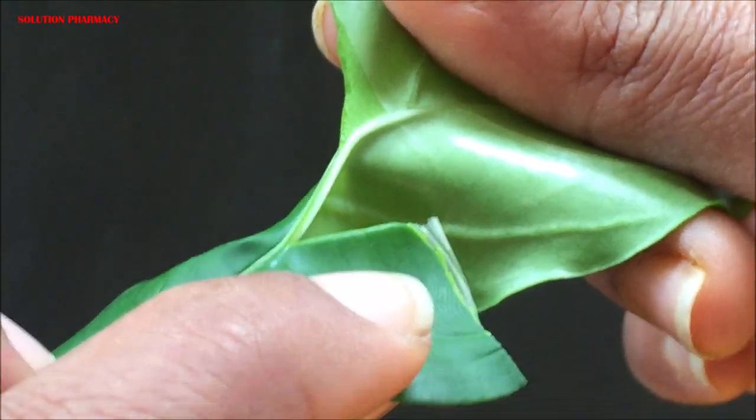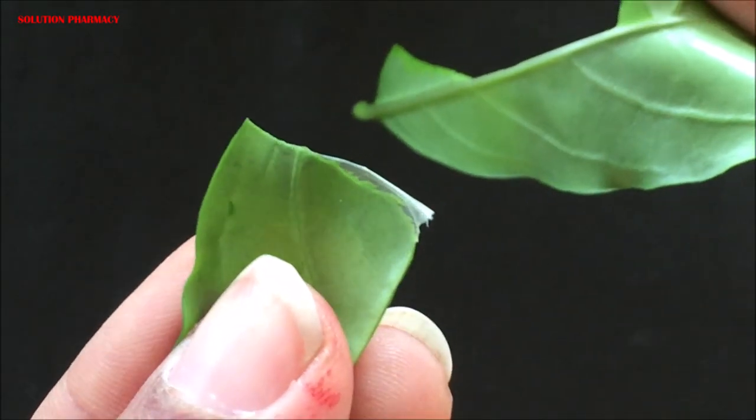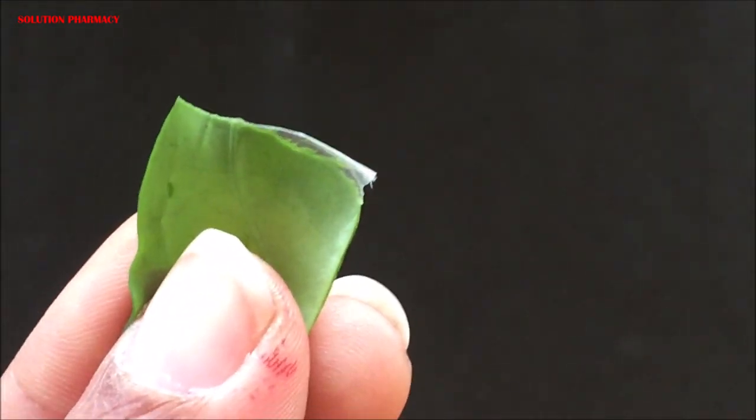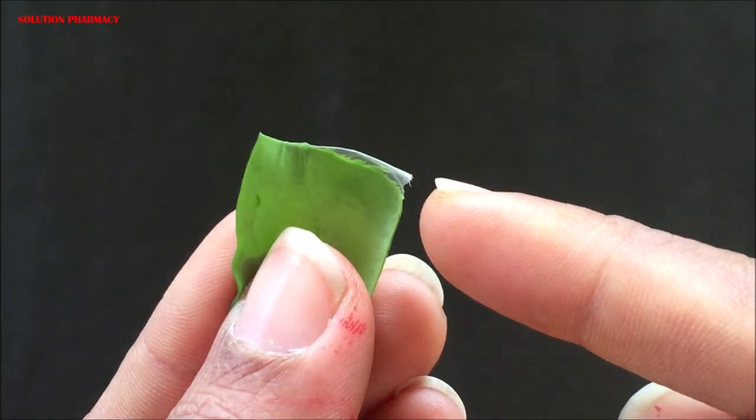Here we have taken the epidermal layer from the lower surface of the leaf, because the lower surface contains a larger number of stomata compared to the upper layer.